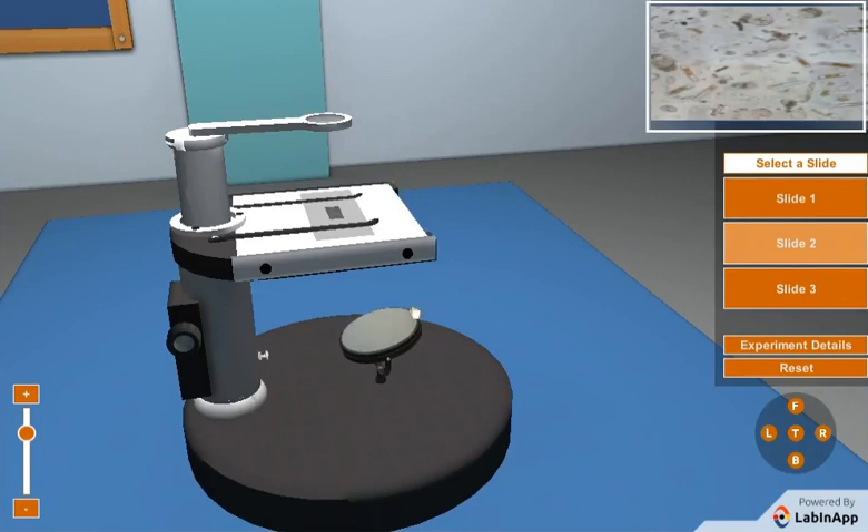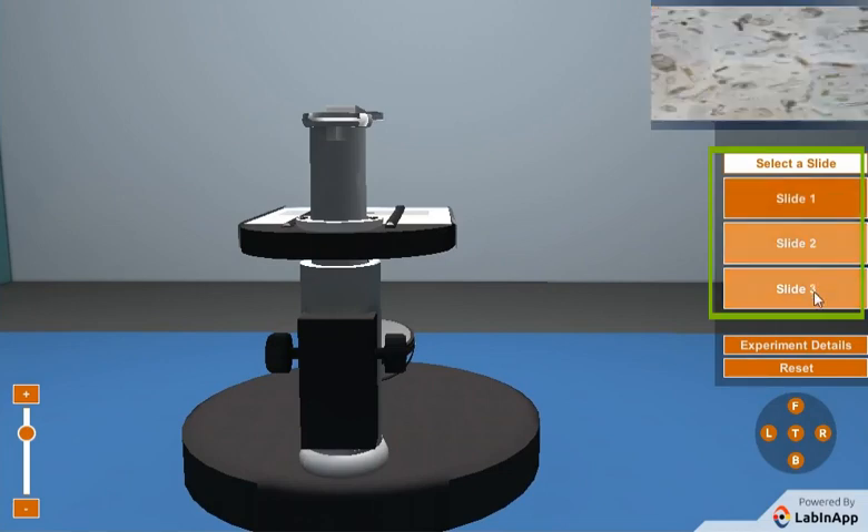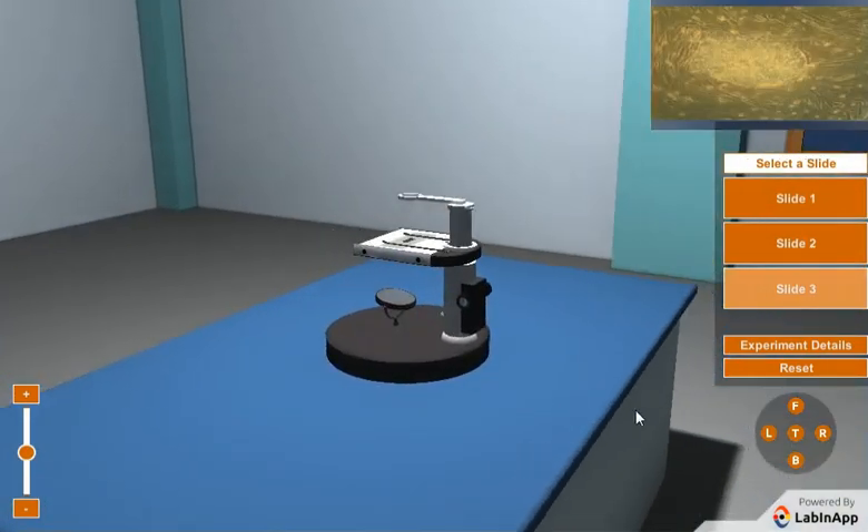Click on the mirror holder to move the mirror and adjust the light on the slide. To see different slides, click on the select slide panel and repeat the same procedure to see a properly focused image.